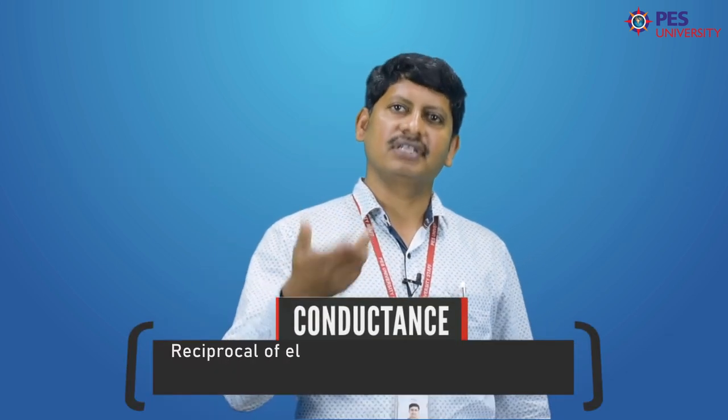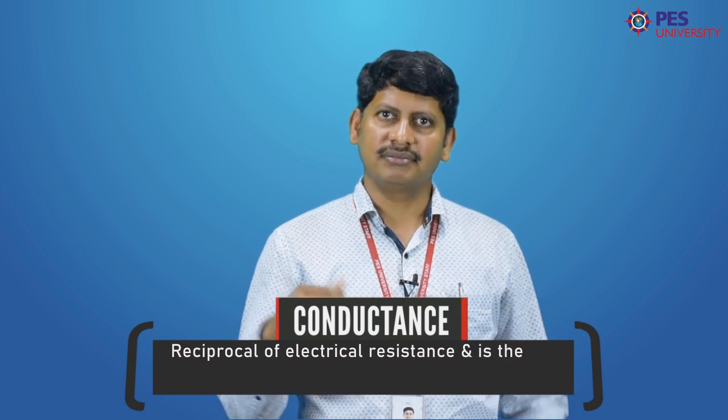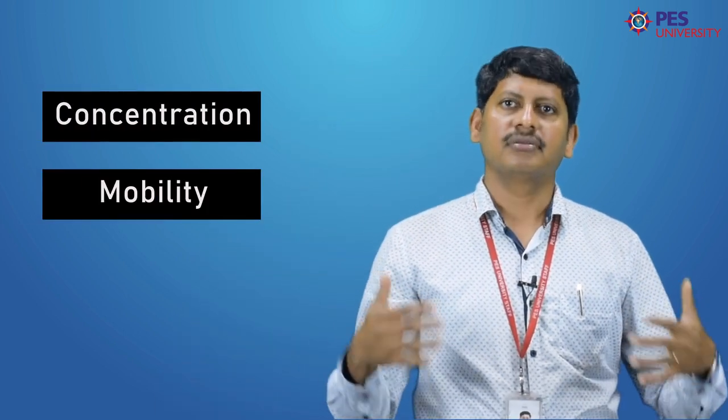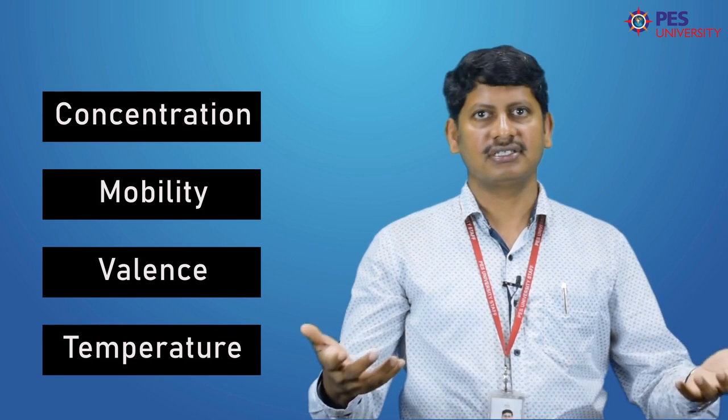Conductance is a reciprocal of resistance and it's a measurement of an ability to conduct electricity. It depends upon concentration, mobility, valence and temperature of ions present in the solution. Experimentally measured conductance of a solution is that of a certain volume of a solution contained between the electrodes of a conductivity cell. Conductometer measures the resistance of a solution between two electrodes and converts it into conductance values.